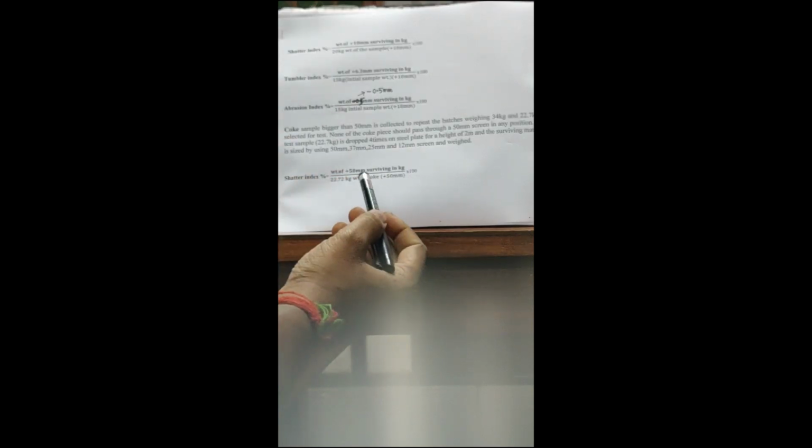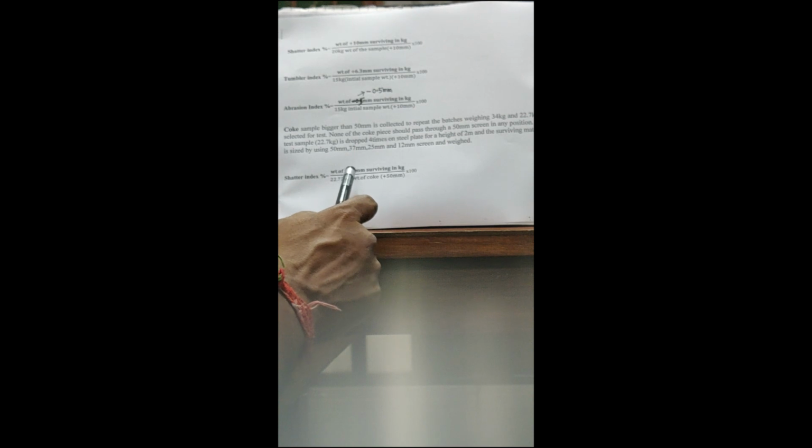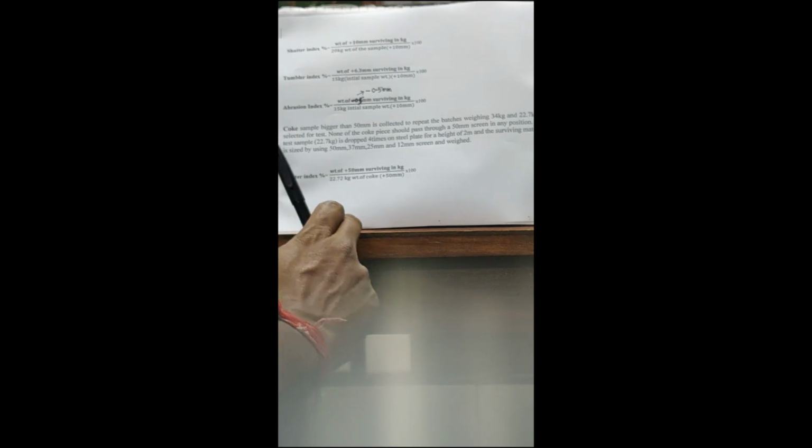So here two things we have to see. Here we are using the plus 50 mm screen. If you want to get an accurate picture of the coke strength, we can use other screens also. If you report them, it will give an accurate picture. Instead of using only one 50 mm screen, you can use 37, 25 and 12 mm also, then you will get a good picture of this coke strength.